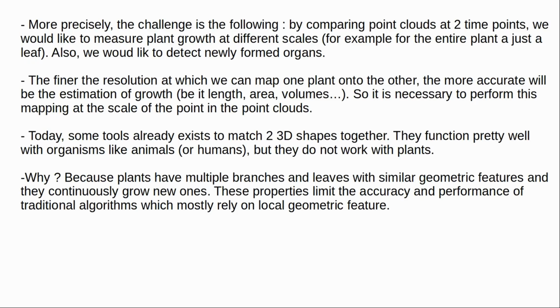More precisely, the challenge is the following. By comparing point clouds at 2 time points, we would like to measure plant growth at different scales, for example, for the entire plant or just a leaf. Also, we would like to detect newly formed organs. The finer the resolution at which we can map one plant onto another, the more accurate will be the estimation of growth, be it length, area, or volumes. So it's necessary to perform this mapping at the scale of the point in the point clouds.